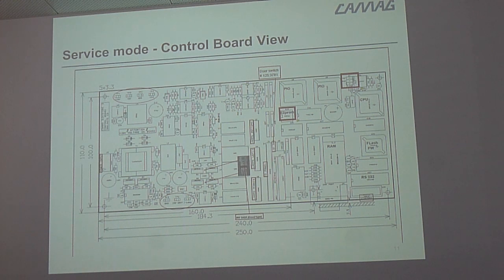Mainly you will order a new board, order this with a serial number. So here you can say, I have this and this visualizer. Also specify the camera. Maybe the camera changed during time. You never know. And then we burn the EEPROM the same as it was when you bought it. So also with the settings that the new visualizer had.